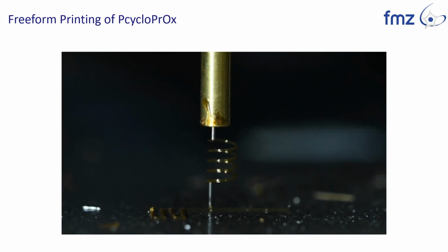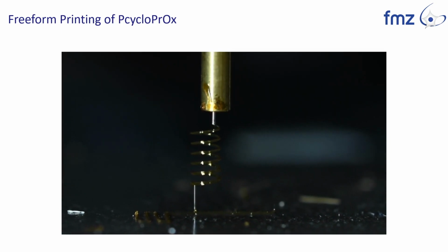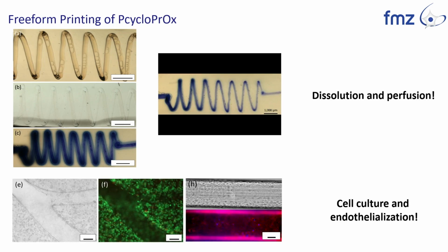With this we basically have the potential to actually try to get three-dimensional vascularization structures. So as before, what we did was to show, when we put them into hydrogels, can we dissolve them? Yes. Can we add a dye? Can we add media? This also works out quite nicely. And also we tried some biological testing with cells in the matrix and endothelial cells in the channel.